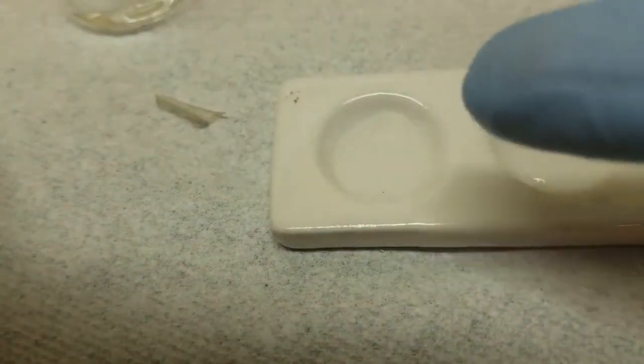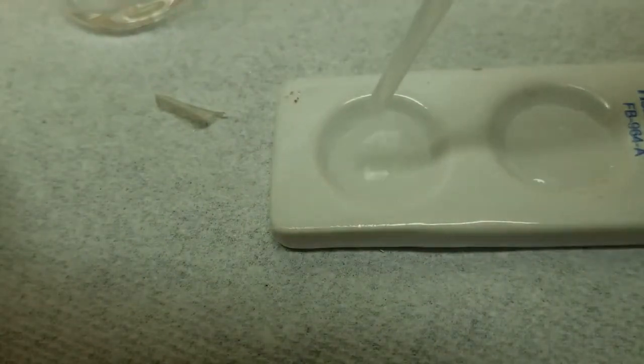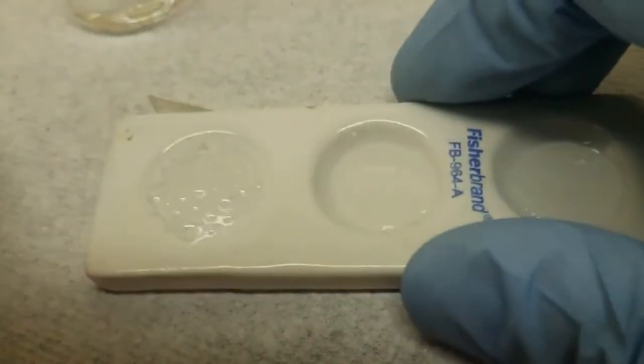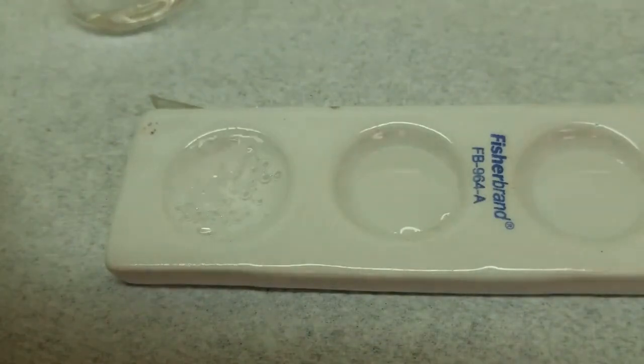Next up, again, I have sodium bicarbonate in here. We're going to add some propanoic acid. To this one, we're going to add some chloroacetic acid. In this case, we have a solid.